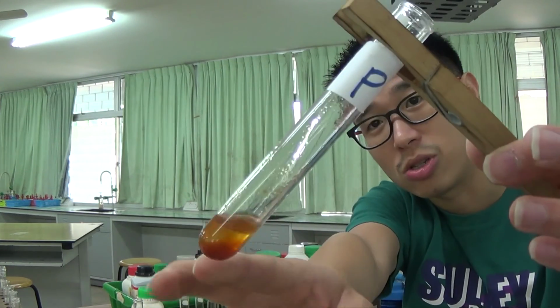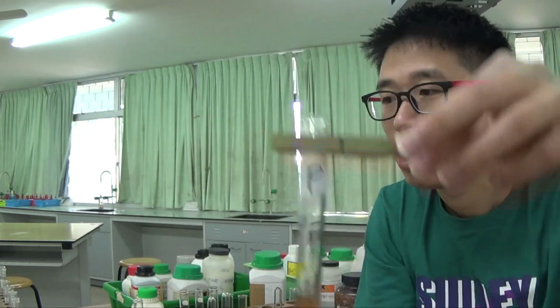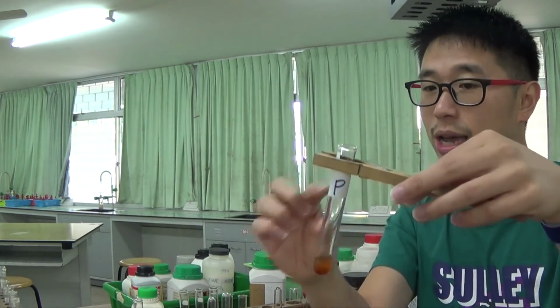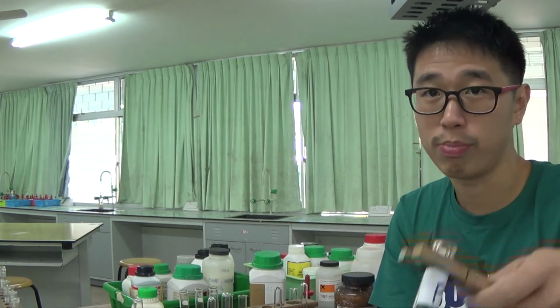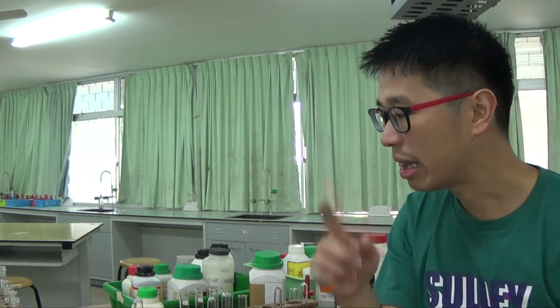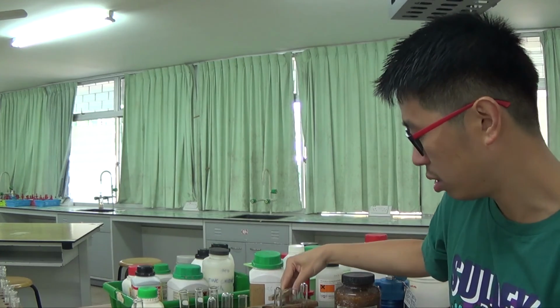Never ever heat a test tube that is more than a quarter full, okay? Throw away some of the solution. After you add in excess NaOH, swirl it, and then throw away some of the solution before you heat it in the test tube. Unless you transfer it to a boiling tube and then you can heat it more intensely, alright? But you can heat a test tube, just be very careful, for a small volume.